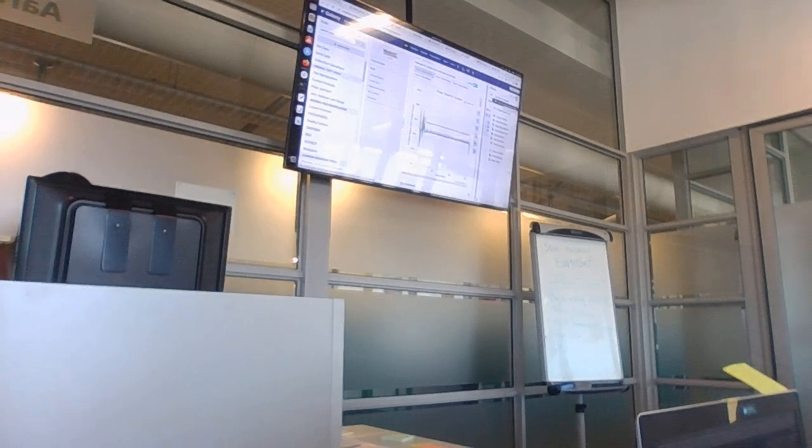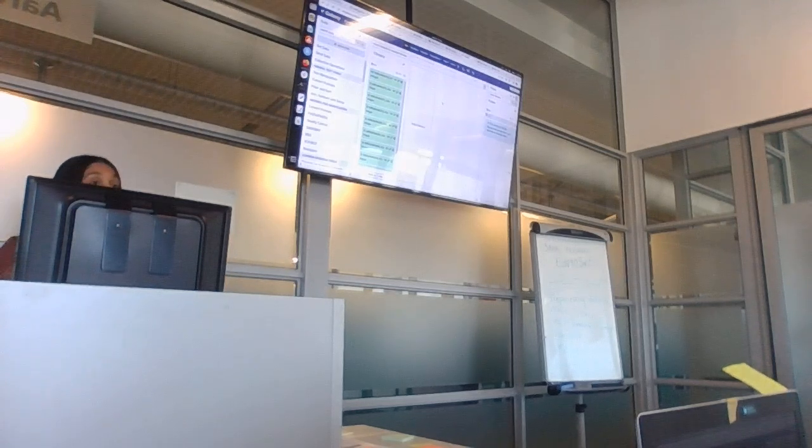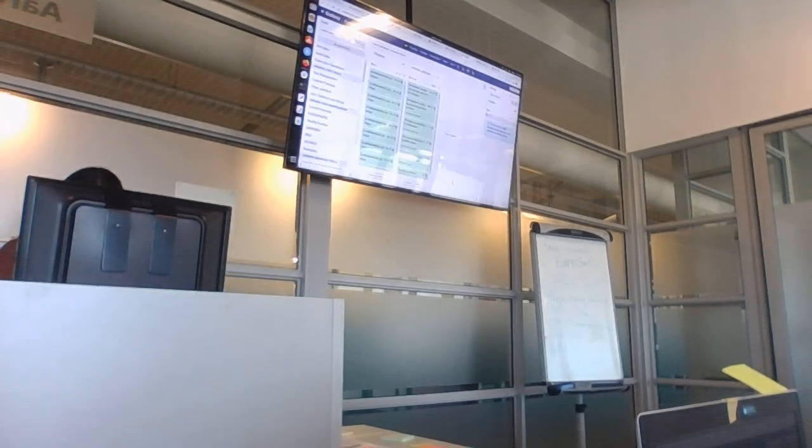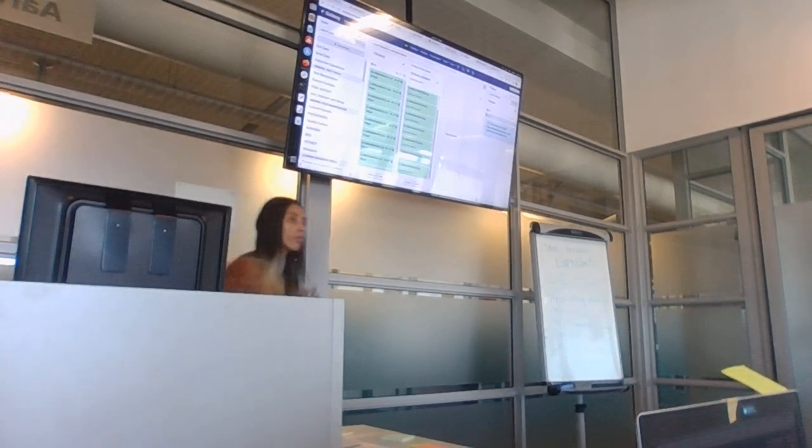Tracey, when is it appearing? What is not appearing? The Corella. Okay, I'll get to you now. Just hold on to me. Just want to see if you could just... Shouldn't see it. Okay, I think maybe you can do it this way. I should play with Galaxy a bit now. Okay, what is not appearing? It's supposed to be Corella. I did say.